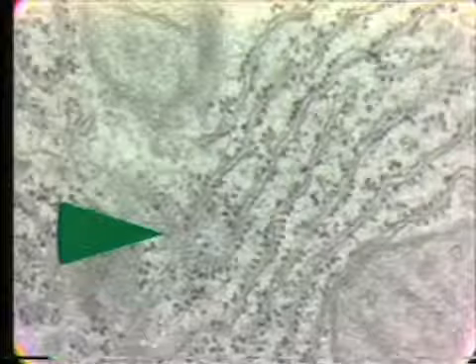Now, at a higher view, we'll notice the ribosomes. These are 150 angstrom in diameter, and the membranes comprising the rough endoplasmic reticulum. Protein is synthesized in concert with the ribosomes and then secreted into the middle, or the cisterna, of the endoplasmic reticulum.